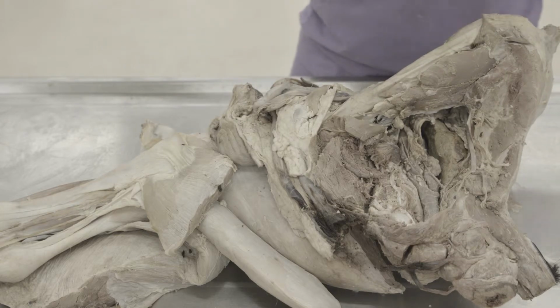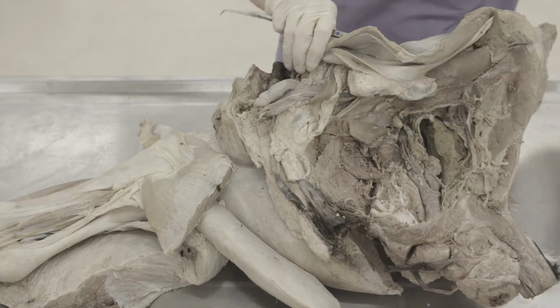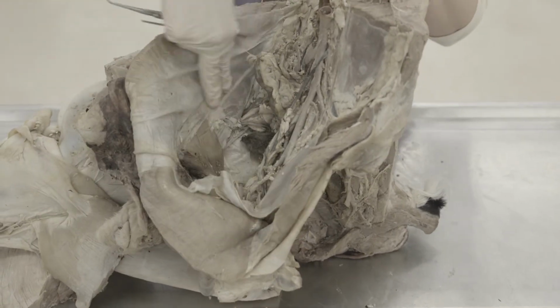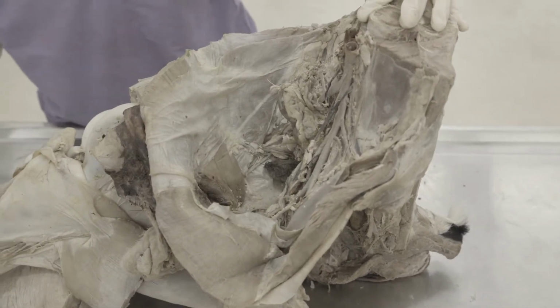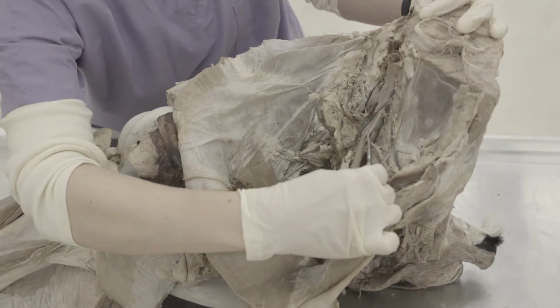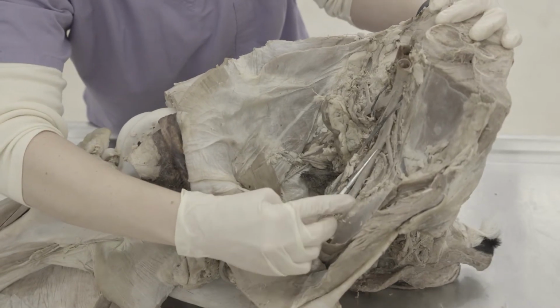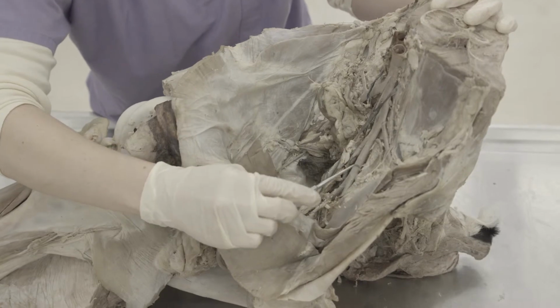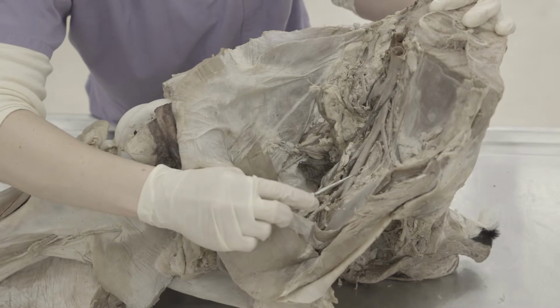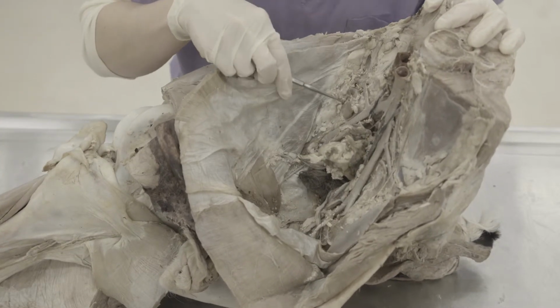The last few structures we need to show you are in the pelvic region inside. And I want to flip it over and just show you a couple of things. Now in the bovine, if you look where the external iliac arteries are coming off, you see where the deep circumflex iliac artery is coming off, and then you'll see very large lymph nodes right in that area. Those are called the external iliac lymph nodes. So you want to look for those. They're usually fairly large, so they're easy to see. You can see them on this side as well.